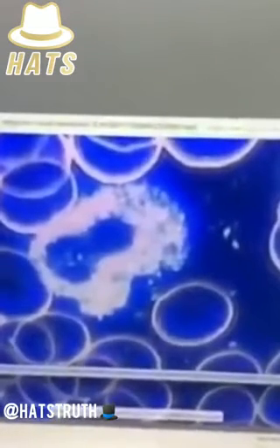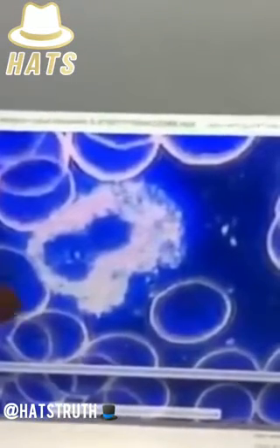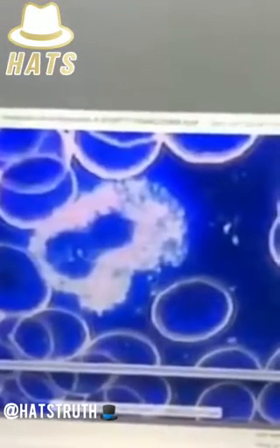So this one is a video. Let's enlarge it. This is really difficult to explain because it's a white blood cell, but also very unusual how it comes out. It's not normal to look at this, and these overactive movements in this cell.